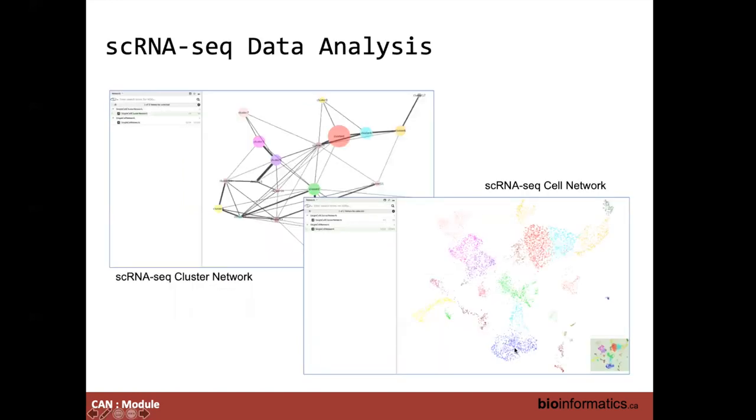The Reactome FI Viz app also implements a suite of features for users to conduct single cell RNA-seq data analysis and visualization. To do this, we've installed a variety of packages, actually several Python packages, I should say. These include Scanpy for routine single-cell RNA-seq data analysis and visualization, and scVelo for RNA velocity-based data analysis.